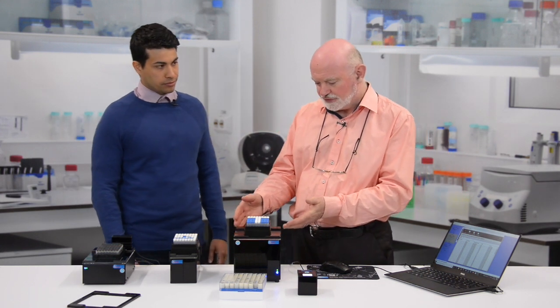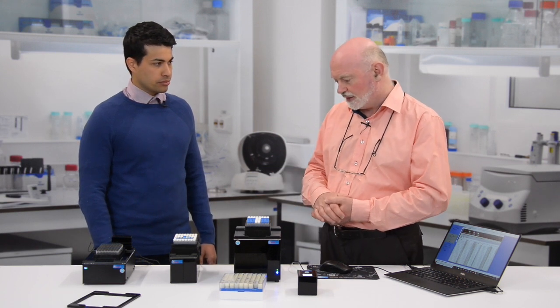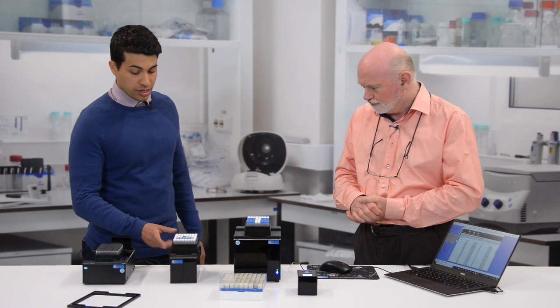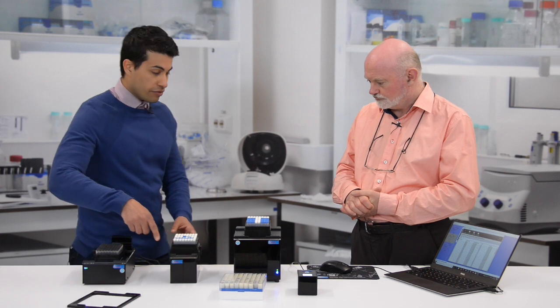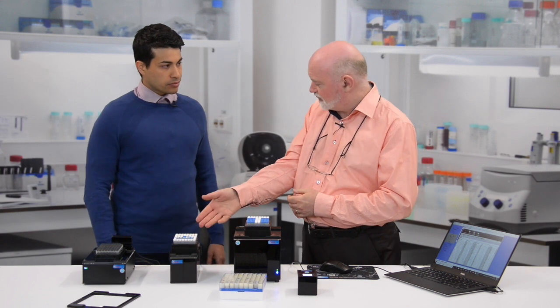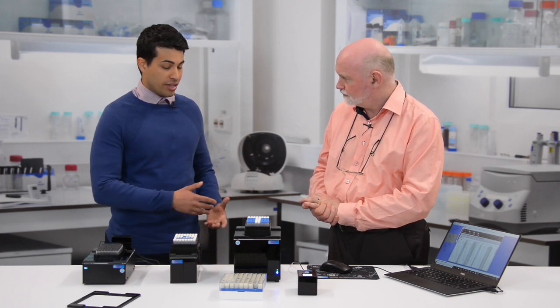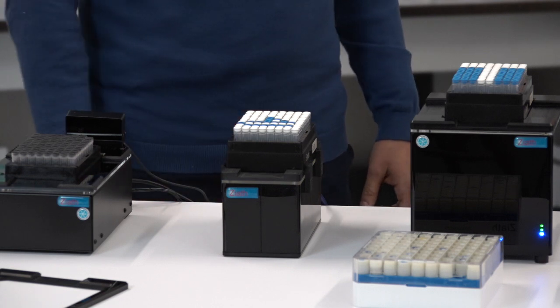So that's the Cube, which is quite versatile — it takes different formats of cryobox and SBS rack. Next to it is the Express. This scanner is ideal for automation because the footprint size is very small. If you wanted to put it on the deck of a robot, that would take up quite a small amount of room. There's a separate imaging part, so that can be away from the robot — the optics are here and the control box can go anywhere else on a different bench.